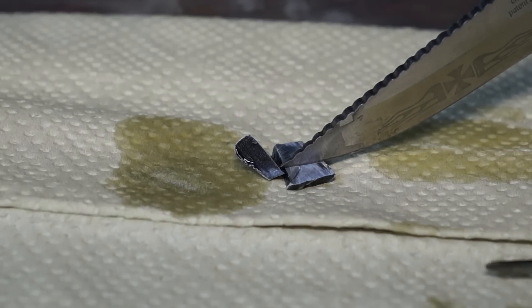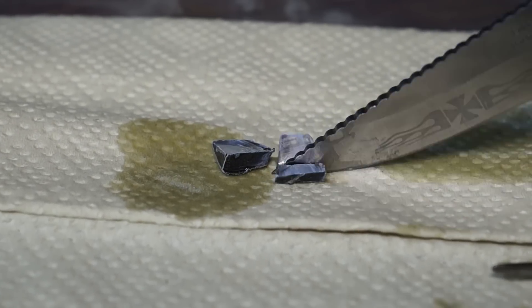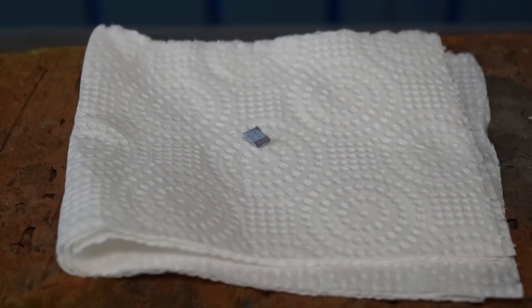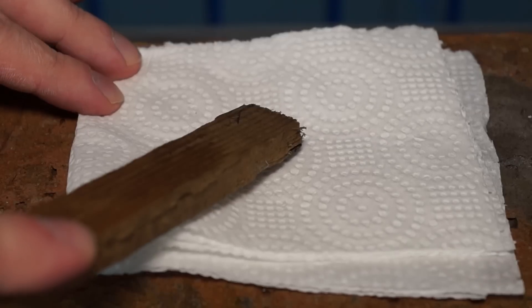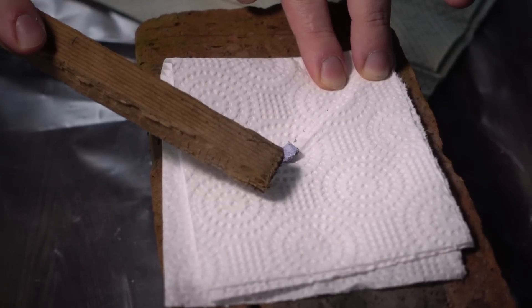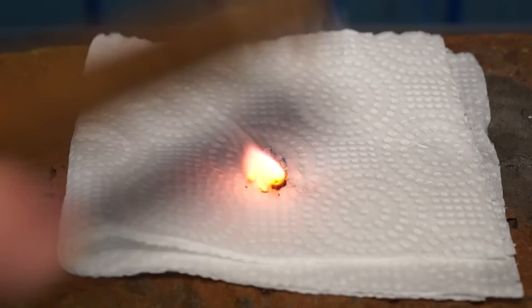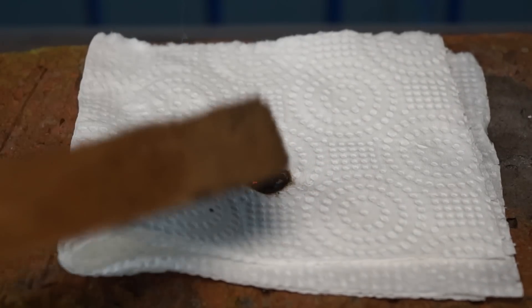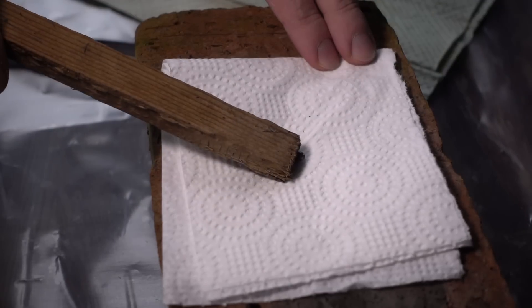Because of its high activity, potassium may spontaneously ignite in air. I took a small piece of potassium and began to spread it on a napkin. Once the napkin is coated with a thin layer of potassium, the latter reacts with oxygen and ignites.